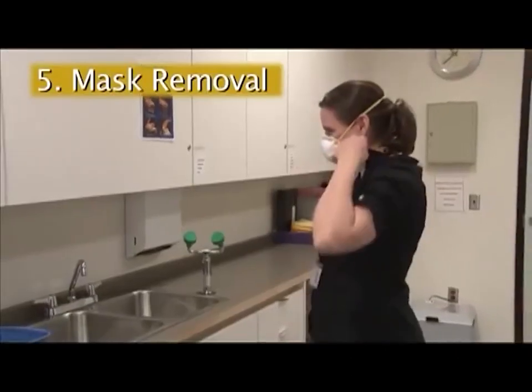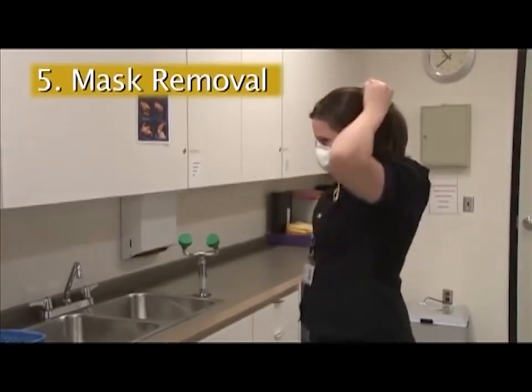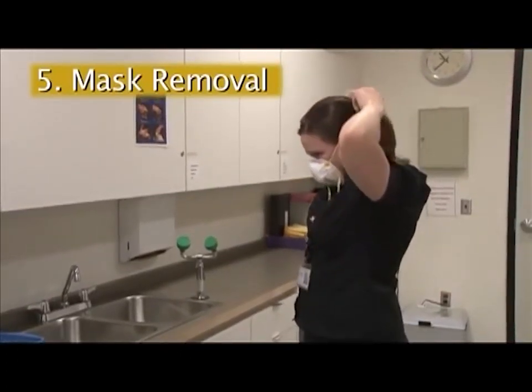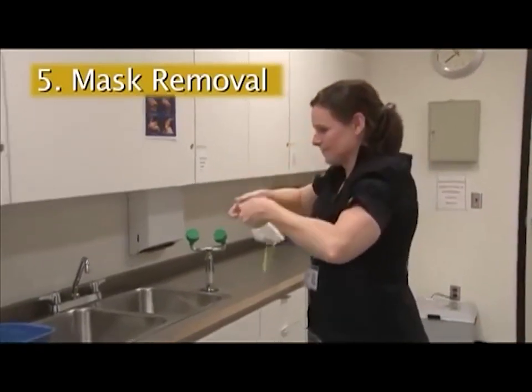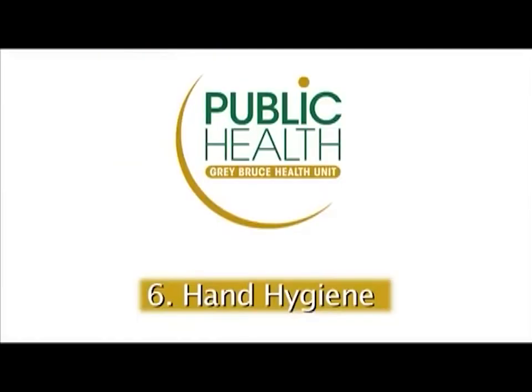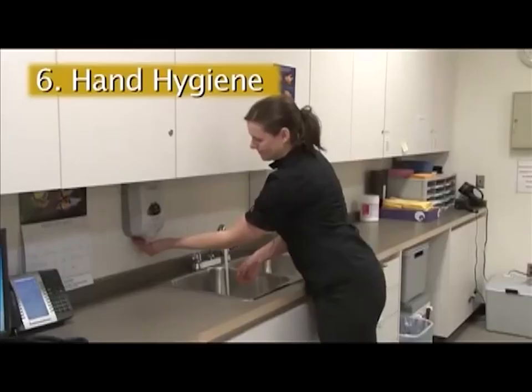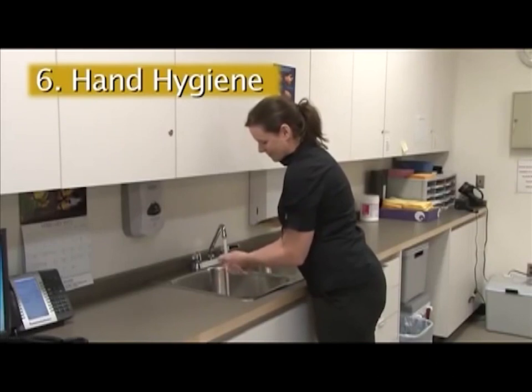The front of the mask is dirty. For removal, handle only the ear loops, ties, or elastic straps. Remove the mask from your face by bending forward and pulling the mask forward in a downward direction, allowing it to fall away from the face, then discard. To complete the process, perform hand hygiene one more time. Remember to perform hand hygiene anytime you suspect your hands are contaminated during removal of protective equipment.